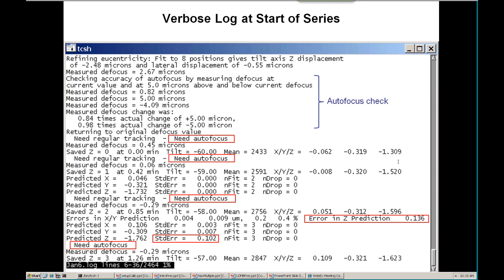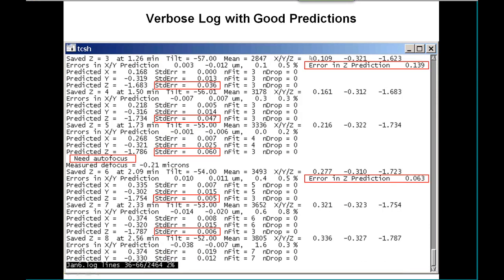The X and Y predictions are good, so it stops tracking, but the standard error is still a little high so it says it still needs to autofocus. We go on to the next tilt and again we have the error in the Z prediction from the autofocus. But this time, when it does the fifth, the standard error is low and it says it can skip focusing, so it goes ahead, skips focusing and tracking, takes another picture, and predicts again.